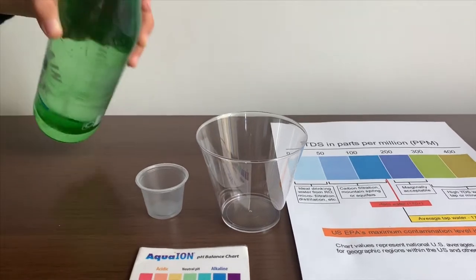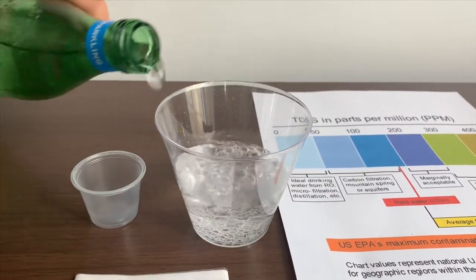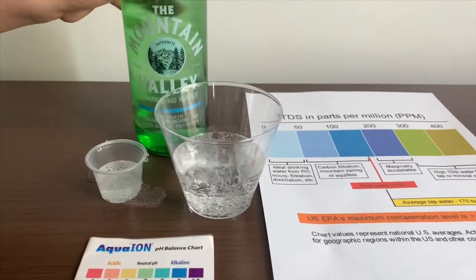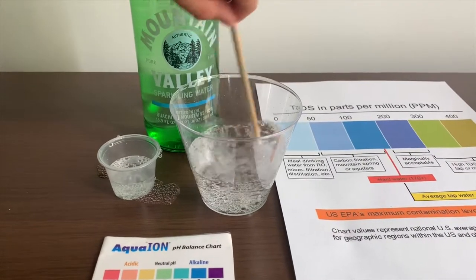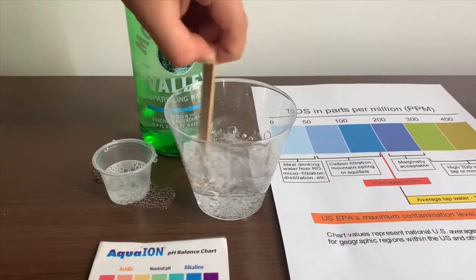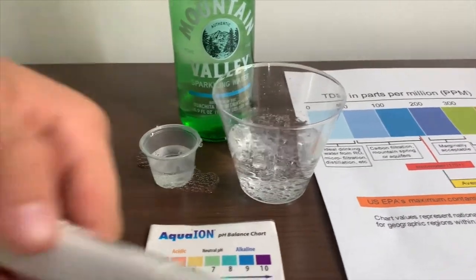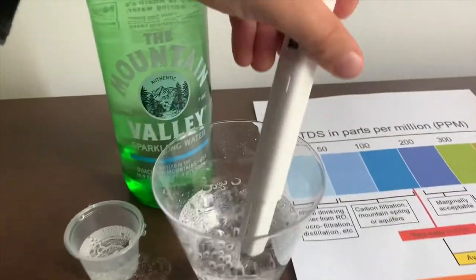Let's pour some water in. First we're going to test the TDS. But before, let's stir it a little so we'll get a better result. Turn on the TDS tester, make sure it says zero and put it in.